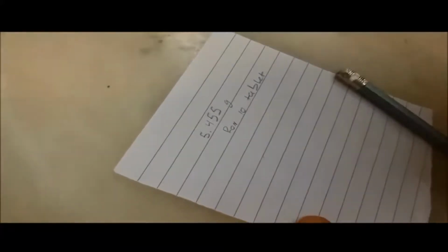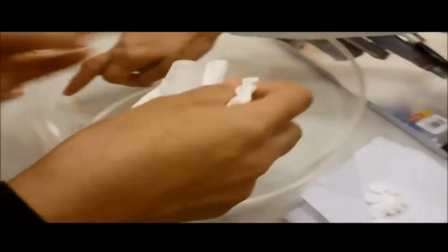We need to write down on a piece of paper how much the tablets weigh initially, and after running the test in the friabilator, we again check the weight and find the difference between the initial and final.